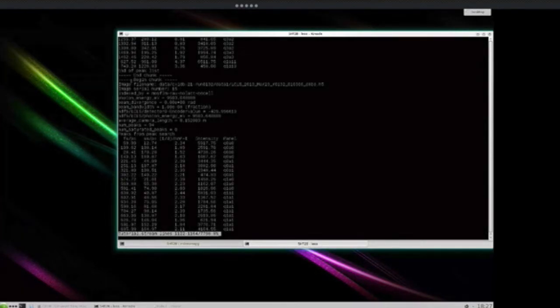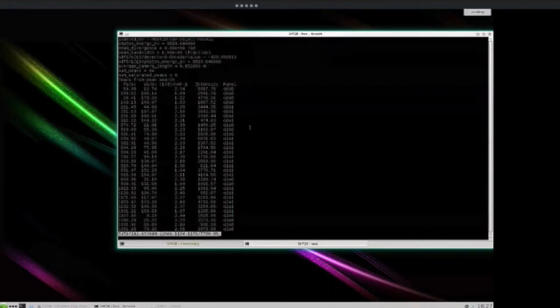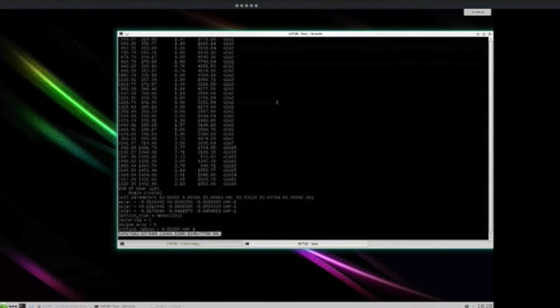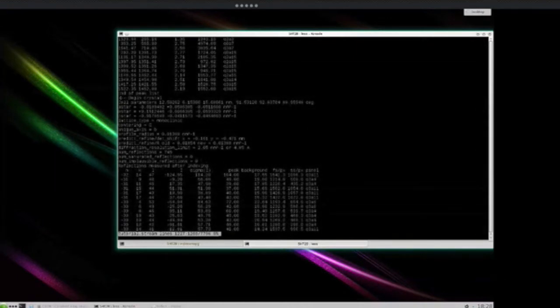So again, we have the chunk boundary, we have file name, we have the photon energy, camera length positions, all that stuff. Peak positions, notice there's more peaks this time, which is probably why this could be indexed. It's a much stronger diffraction pattern. And that's followed by crystals.